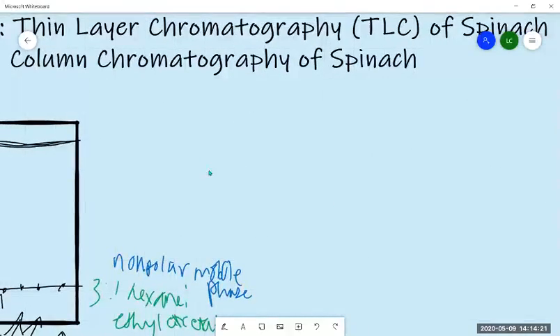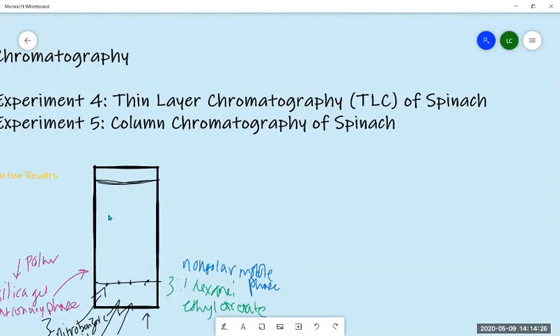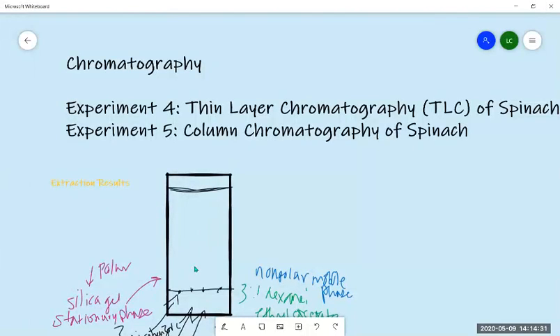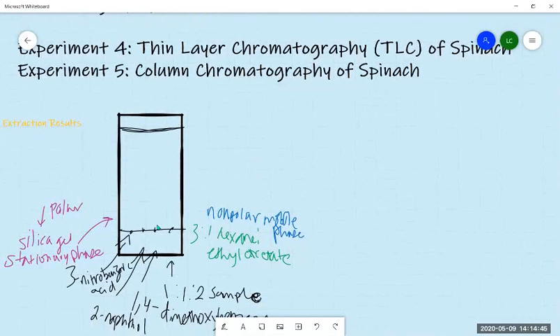So if you're going to categorize them, your planar type of chromatography is TLC because you have the silica coating on your plastic. You might also note that this is more like paper chromatography if you've ever done it with a coffee filter or something, and then you have different colors, maybe put ink, and then you see it separate into different components and different colors of ink. So that's what TLC is.